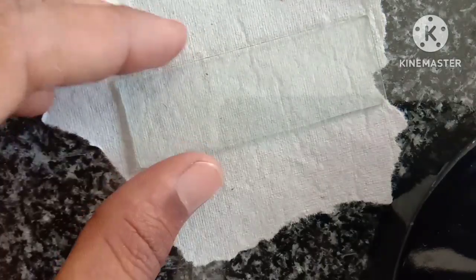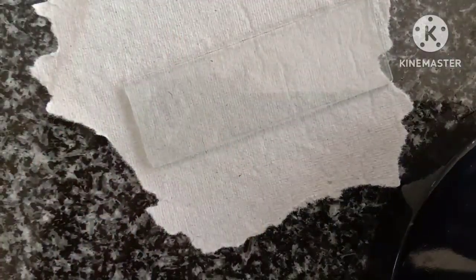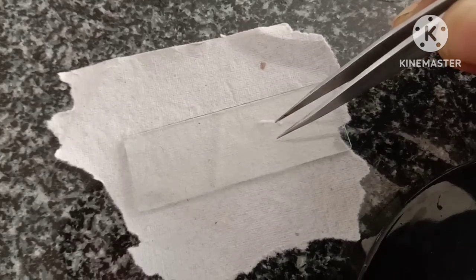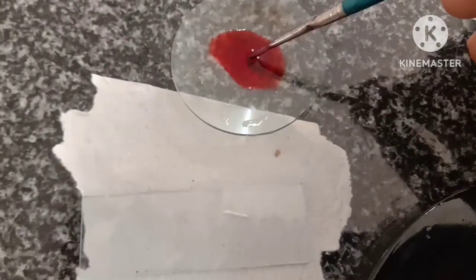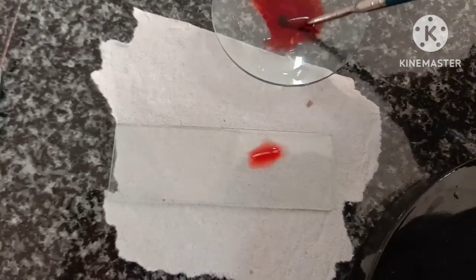Now take a clean slide and transfer the treated onion root tips to a glass slide, and stain with a few drops of acetocarmine. This is acetocarmine stain. If there is excess stain, you can remove it with blotting paper or a blotting sheet.